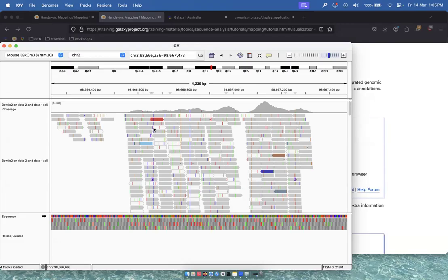As you will also notice, some of our reads are white, and that is because the mapping quality is equal to 0. The interpretation of this mapping quality depends on the aligner, as some commonly used aligners use this convention to mark a read with multiple alignments. In such a case, the read also maps to another location with equally good placement. It is also possible that the read could not be uniquely placed, but the other placements do not necessarily give equally good quality hits.